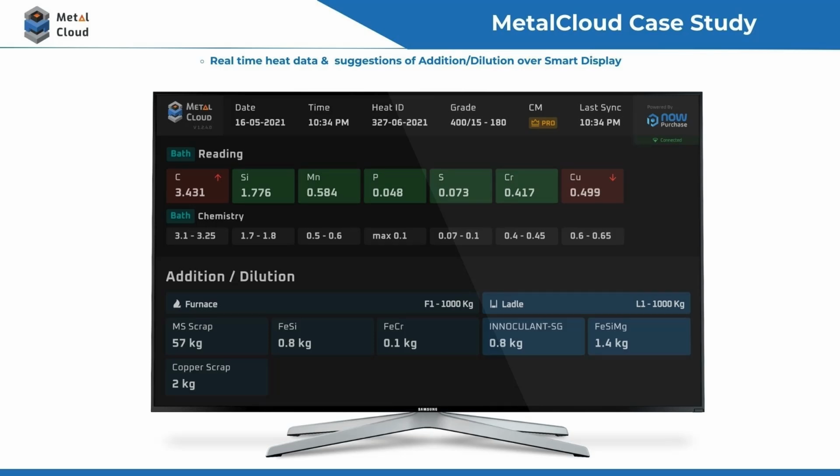Right. Similarly, when data is being collected digitally, it will be stored digitally also, and you will be able to see all the data in a list. You can see it in the second quadrant of the screen. You can now see that all the heat data is clubbed and kept in one place under bath final. So the point I am emphasizing is that by connecting the spectrometer or different equipment, you will be able to gather, store or analyze all the data which is being generated in the system on a daily basis.